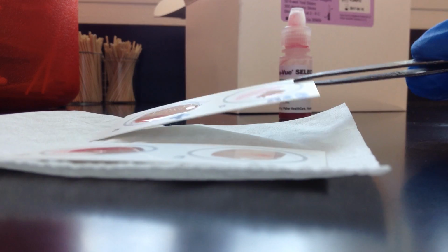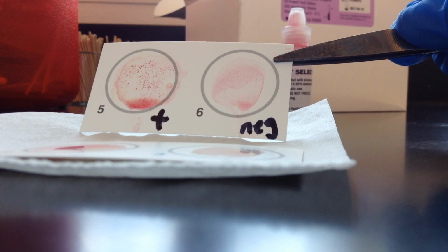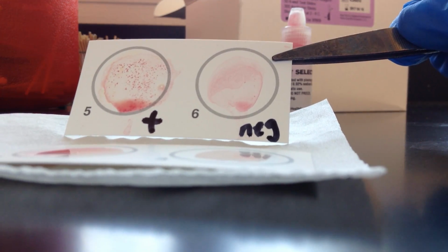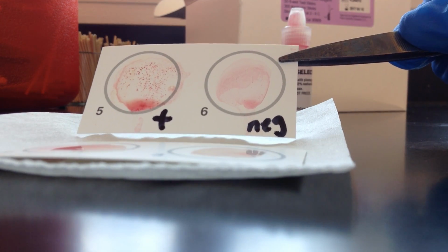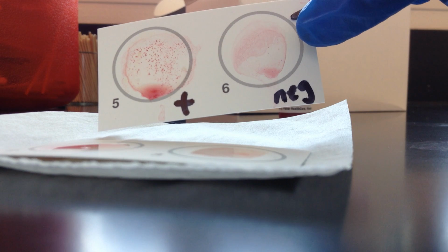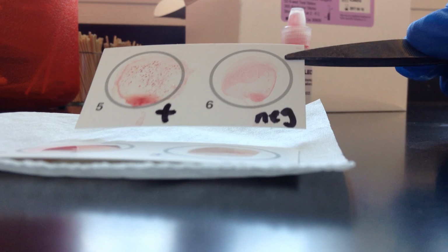So I have one here that's been sitting a little bit longer, and what I want to show you here is on the left where you see the plus sign. You can see these red clumps that form here. This is a latex particle that's been coated with a protein that will simulate that plasma clumping with the reagent added. And then on the right here, hopefully you can see the negative. So you can see the clumping that's over here on the one side, on the plus, and for the negative you don't see those little specks form. And this organism would be considered coagulase positive, and we would use that as an indicator of pathogenicity.